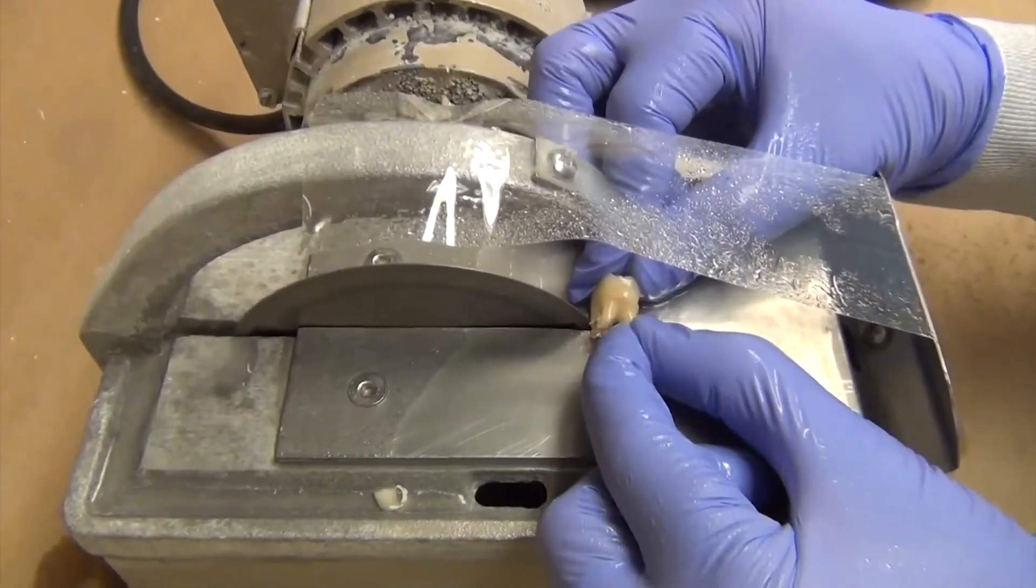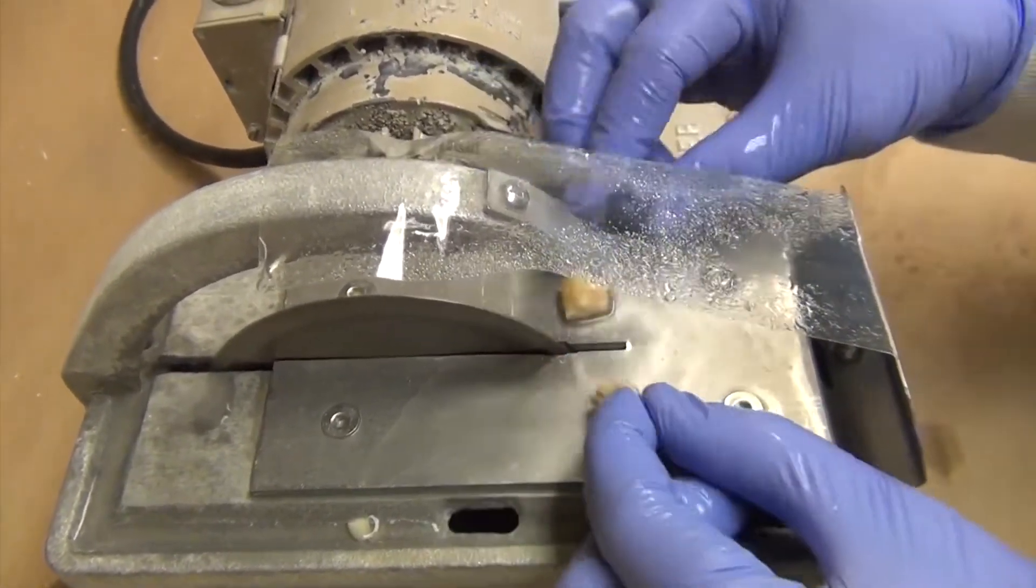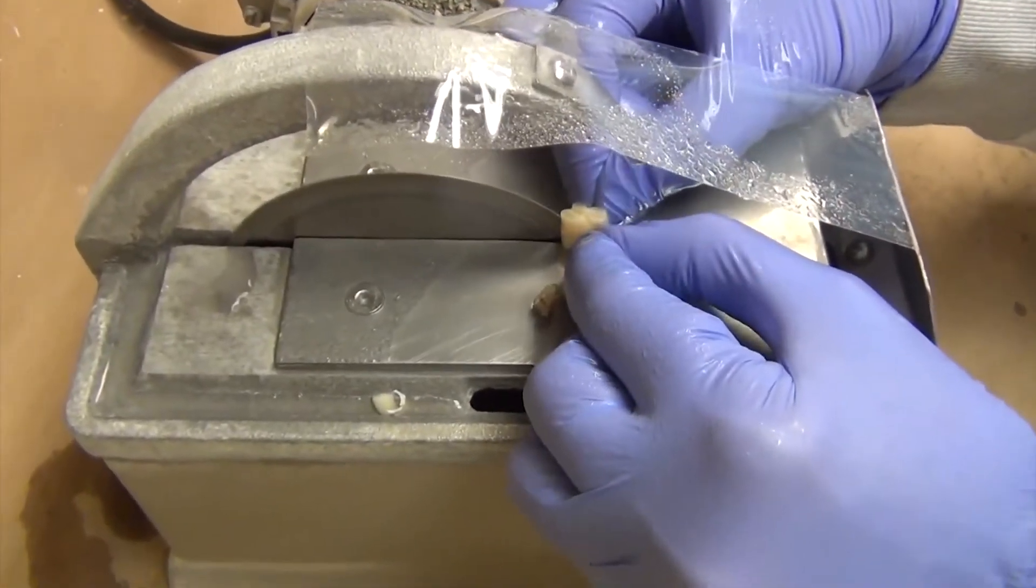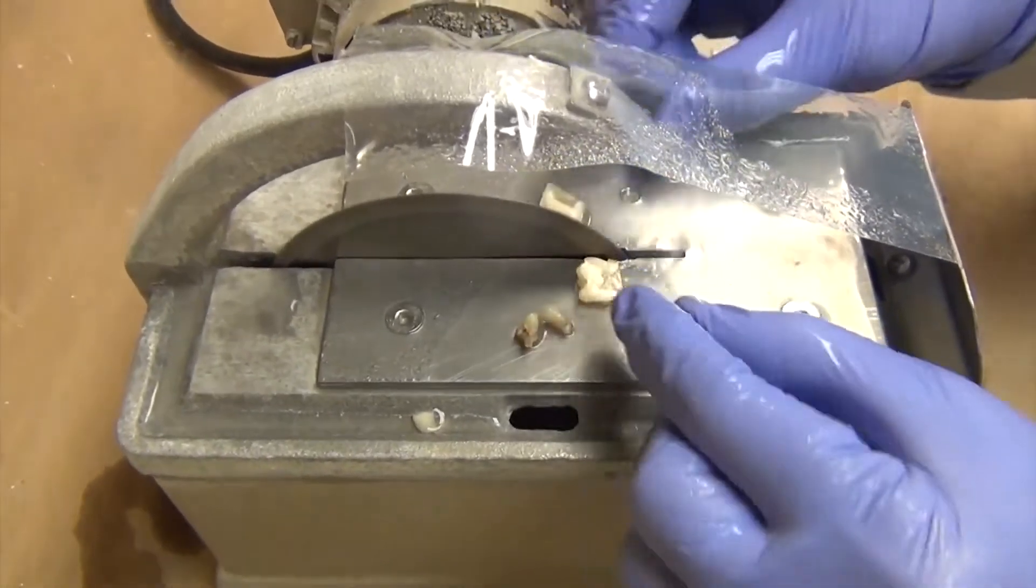The first step in specimen preparation is to section the roots off. This is then followed by rotating the tooth into a vertical position and sectioning through the halves of the tooth. This gives us two usable bonding surfaces for bond testing.